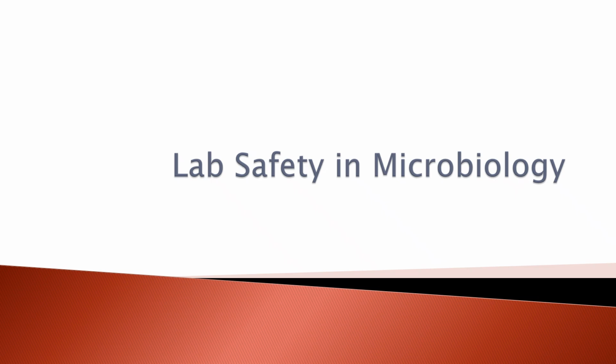Hi everyone, this is our first lab in microbiology, and we're going to be talking about lab safety. Now, you guys are taking lab online, so there's a lot of things that obviously don't apply to you because you're doing this virtually. However, you are still required to know all of the safety protocols for any standard lab and what you would be expected to do in the labs on our campus.